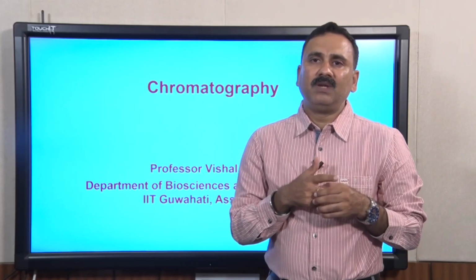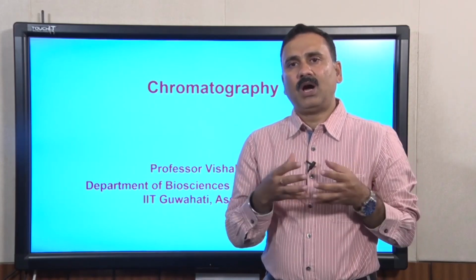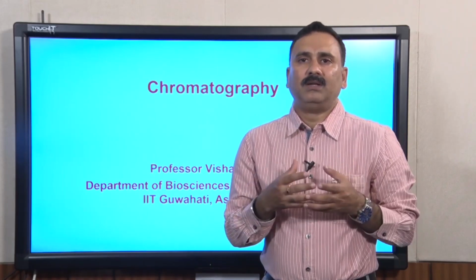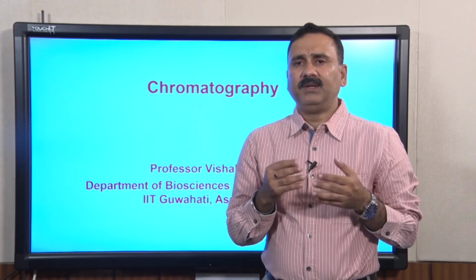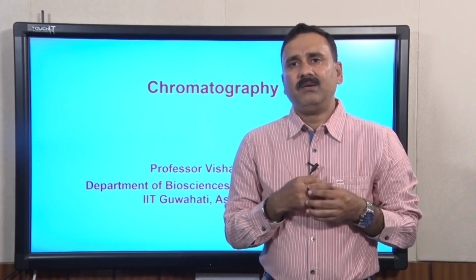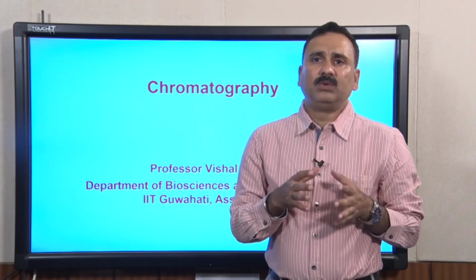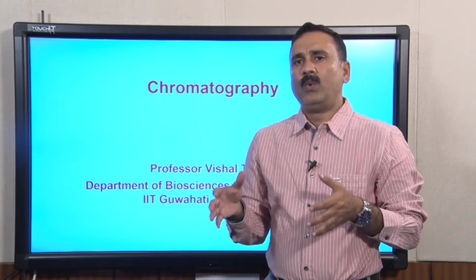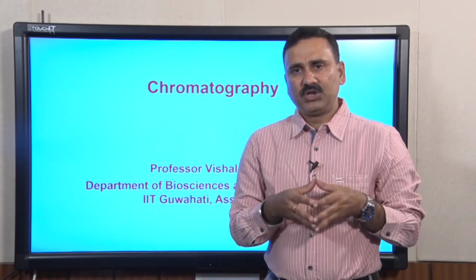In today's lecture we are going to discuss how to purify or isolate the protein of your interest. This process is extensively done by employing chromatography techniques, but before getting into the details of chromatography, we are going to discuss the basic principle of separation.